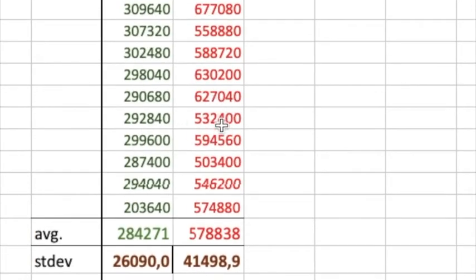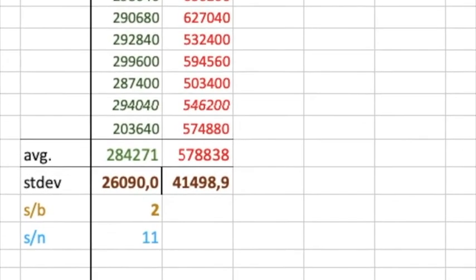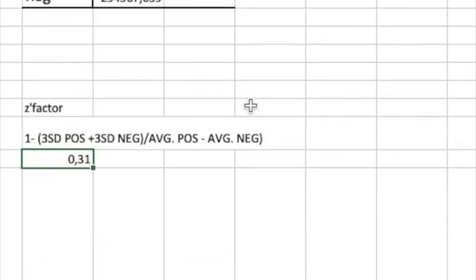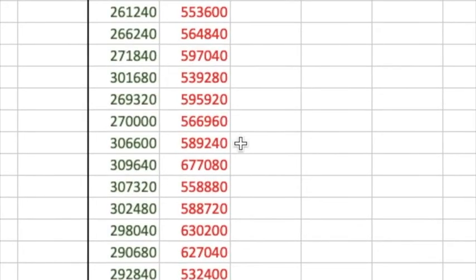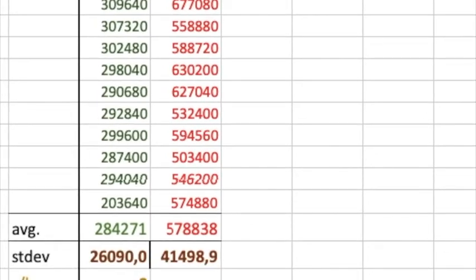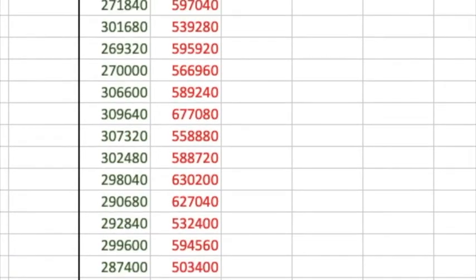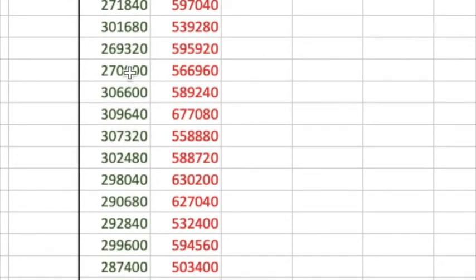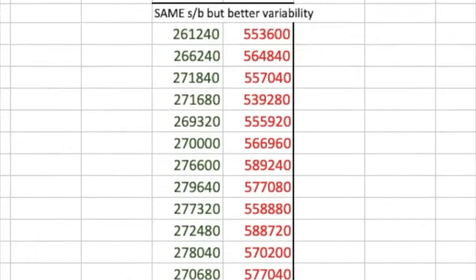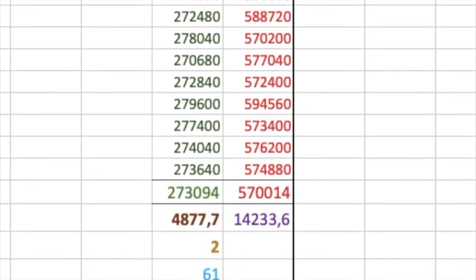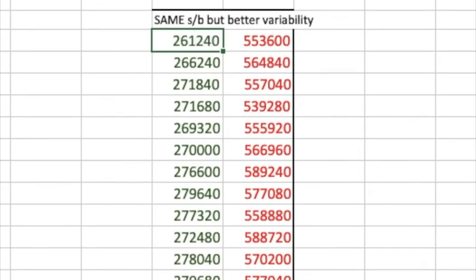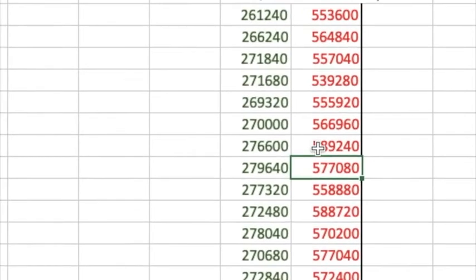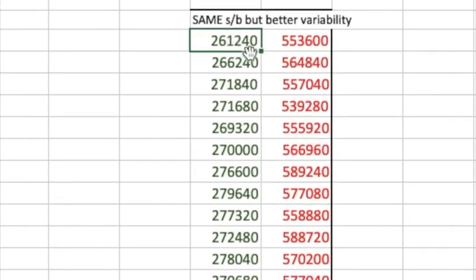There are two ways we can fix this: increase the signal between the positive and negative, or reduce the variability. Let me show you how impactful it is if you reduce the variability. We're going to take this exact data set and reduce the variability between values. Before we had 203,000; 294,000; 307,000 — quite spread out. What if we had a data set where the variability was much, much less? Here's the improved dataset — all I did was tighten the values: 261,000; 266,000; 271,000 — no 300,000 outliers.